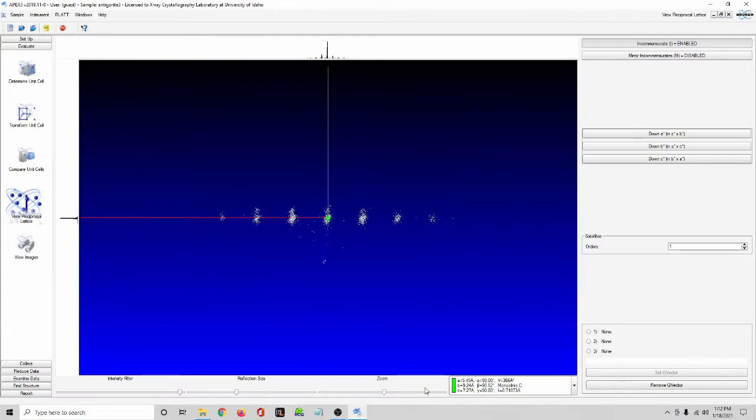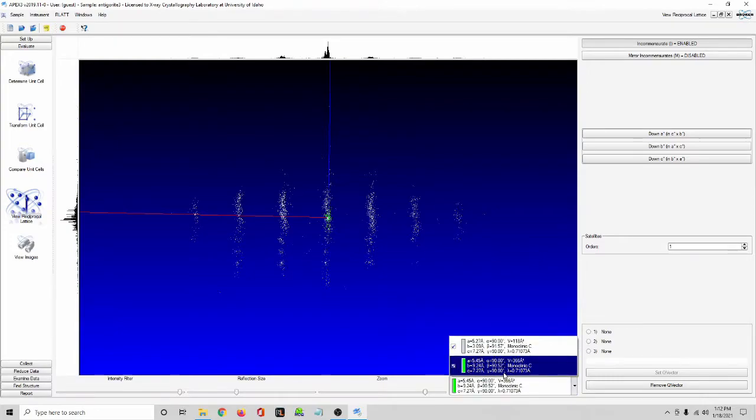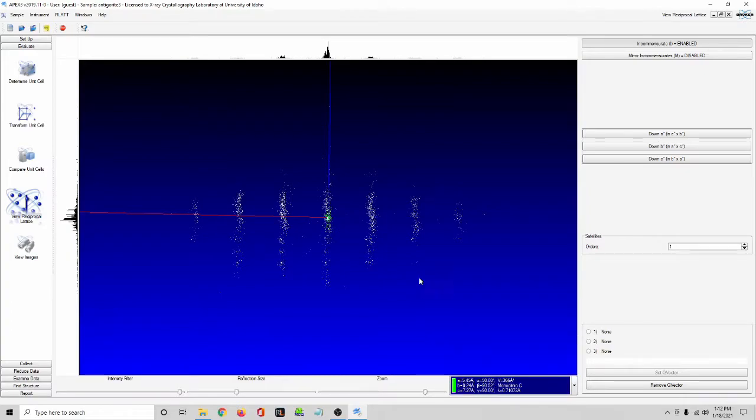So this does an interesting transformation where it shows everything in the central position here reflects, well, it has reflections of this lattice, of the sublattice. Everything that is spaced out away from this lattice will be in different positions relative to 0. So it's just a transformation showing the deviation from this lattice, basically.